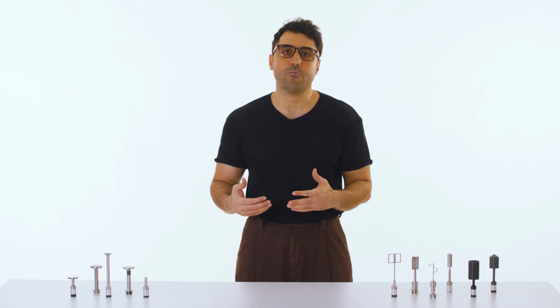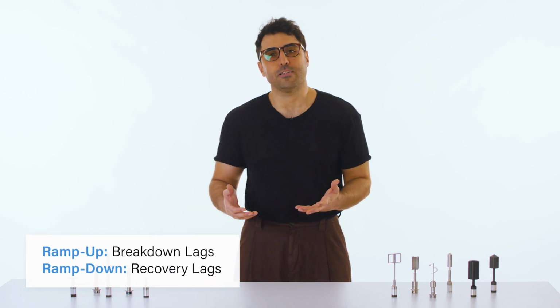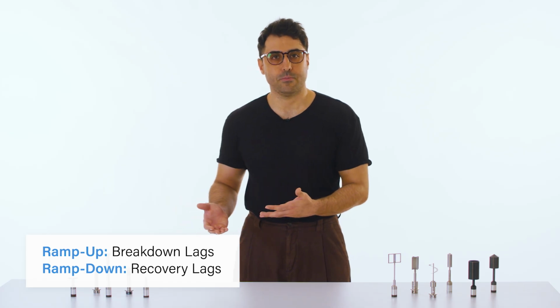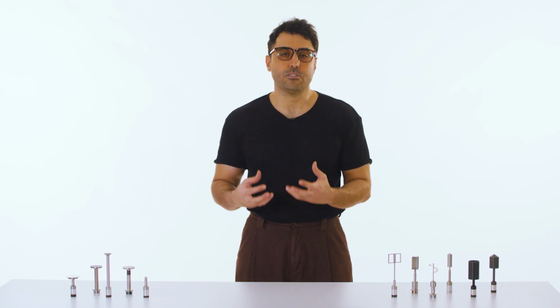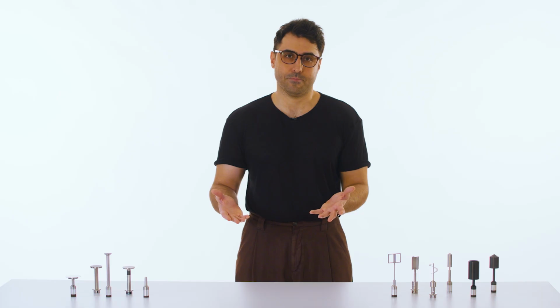So when the shear rate comes back down, the stress or viscosity is much closer to the true value. And the more thixotropic the material is, the more pronounced this divergence between the two curves becomes.